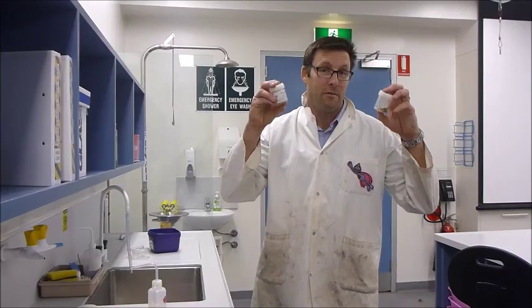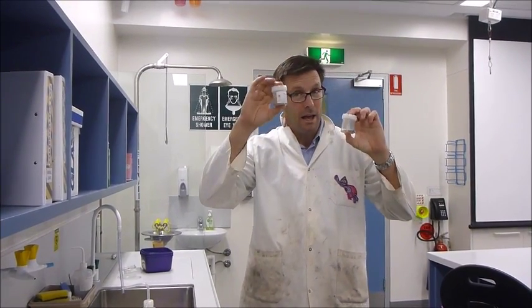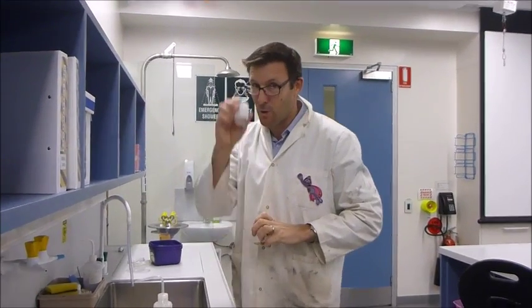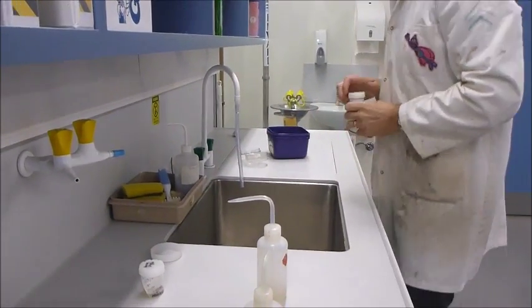And so we've just returned from the field. We have our 2 jars, our rock sample and our invertebrate samples, and don't mix them up. So we'll do one at a time. So we'll put our rock sample aside and come back to that later.